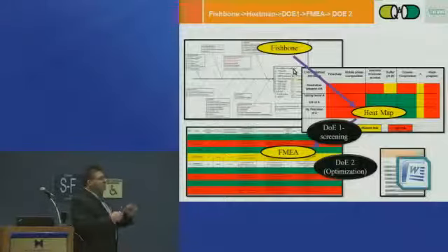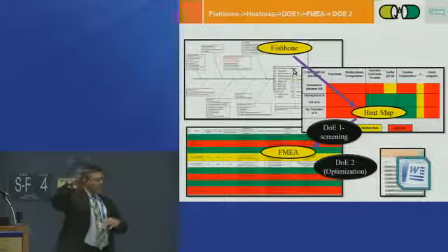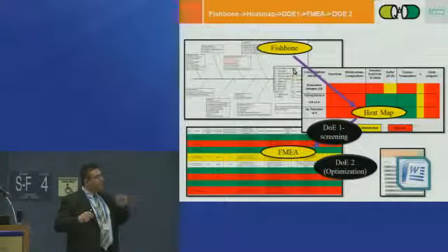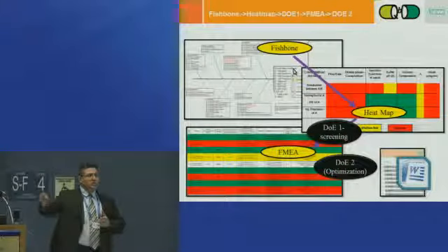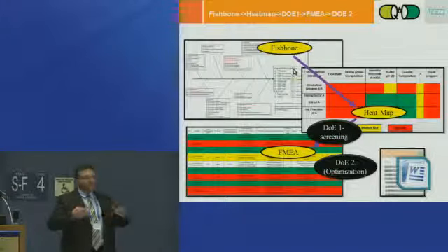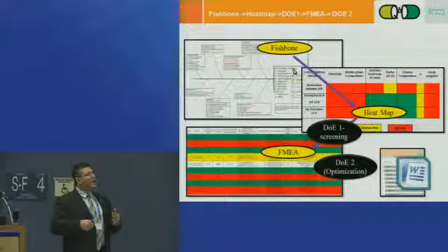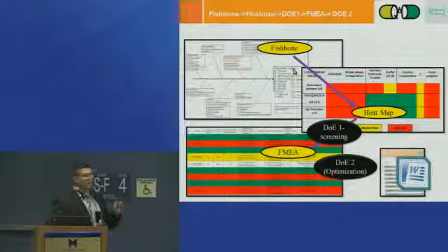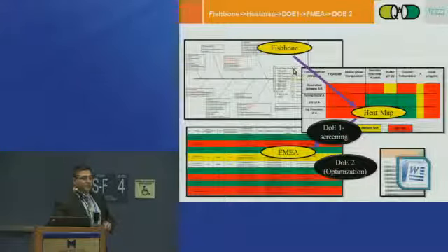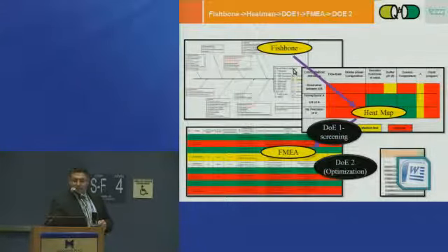And all of this is already, you have a report, and as you start to gain pieces of information, it already pre-populates the report template. So at any juncture throughout the development, you just have to hit print, and your report comes out up to whatever stage that you've completed. Very automated. The name of the software, by the way, is Light Pharma. It's a company in Northeast United States. And there are also other software packages out there as well, but we haven't evaluated them, so I can't really speak on them.